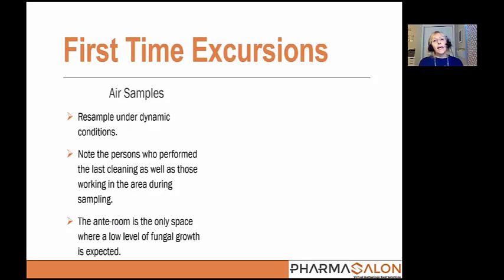And the reason that, again, I don't really totally freak out about mold in the ante-room, especially if it's one CFU every once in a while or two CFU every once in a while, is that if you're not seeing those organisms make their way into the buffer room or into the ISO 5 PEC, you've won the game. The ante-room has done its job, which is meant to be for high particulate activity and to remove those risks from further migrating into the compounding space.